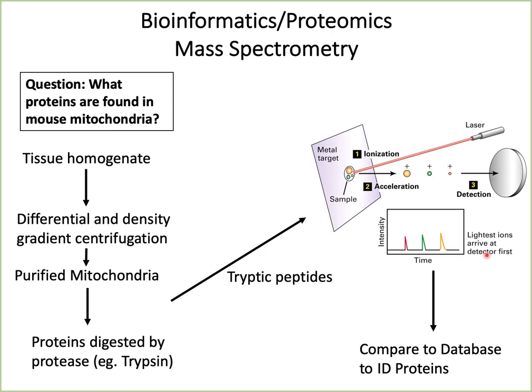And from that protein sequence, you can have all the possible nucleotide sequences, and you can compare with the database, and the computer will churn these numbers. It's a huge task, but fairly quickly it identifies which amino acid sequence each peptide is made up of. It can tell you the exact amino acid sequence, assemble them together, and tell you what proteins were present in there.